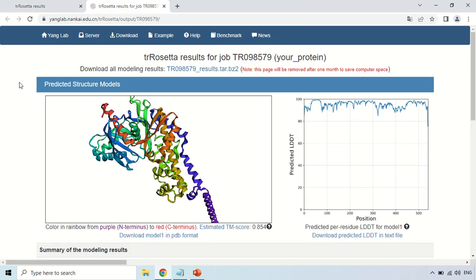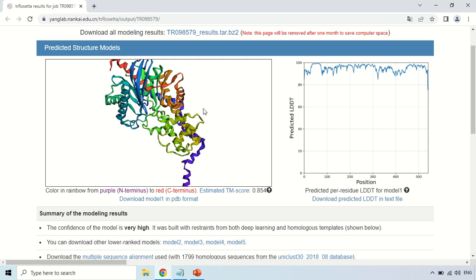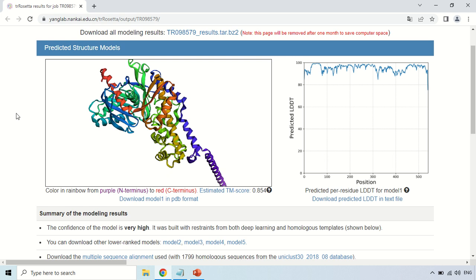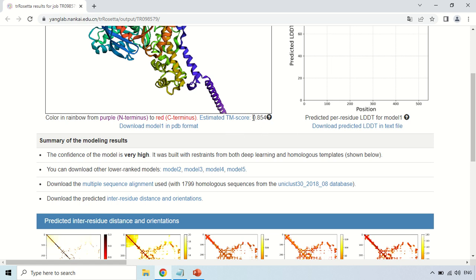So these are the results I received. To interpret these results: first, this diagram is the tertiary structure — you can move it in any direction. This is the tertiary structure of the protein generated from the sequence you provided. Here it shows that the estimated TM score is 0.854. The TM score is a score given for the aligned sequences, and its range is 0 to 1. When the score is closer to 1, the structure is considered the best predicted structure. Since our score is 0.854, which is close to 1, we can say this is a well-predicted structure.